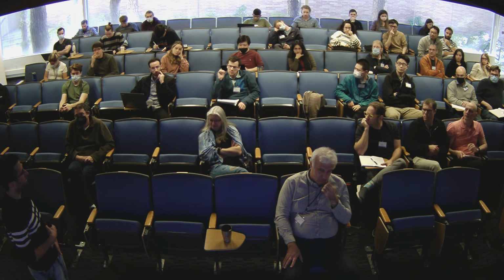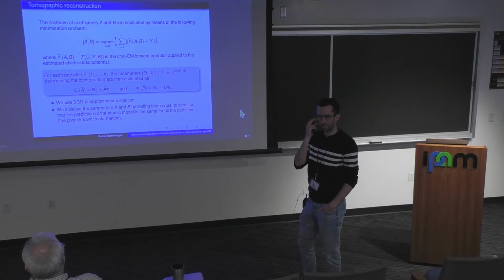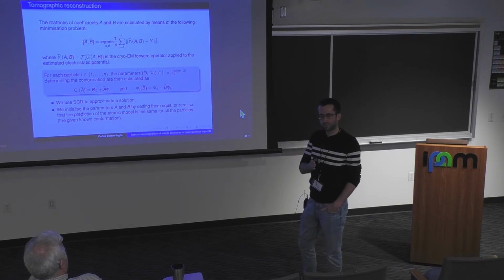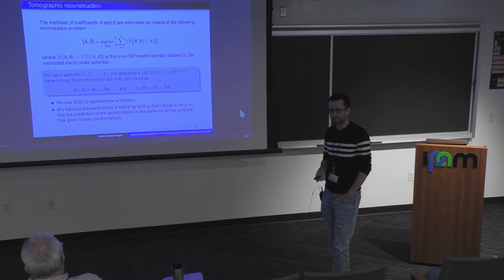Well, it depends. K is maybe, I took the order of 15 or something like this. It's not huge, no? I mean, if we compare with deep learning techniques, it's small, no?